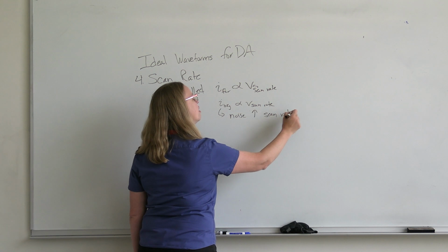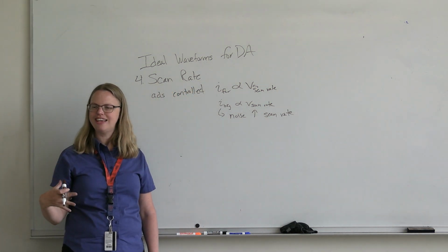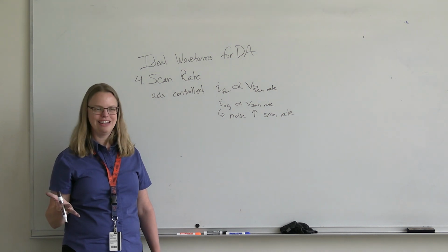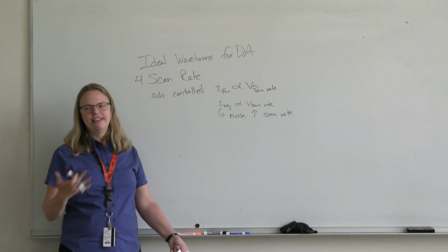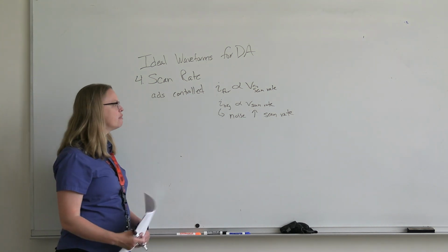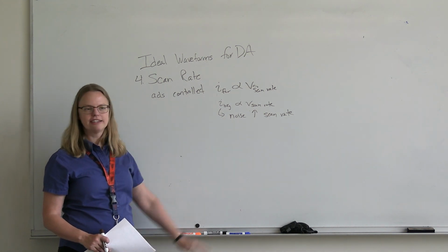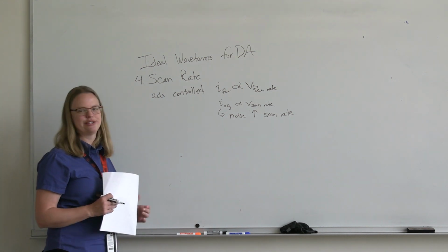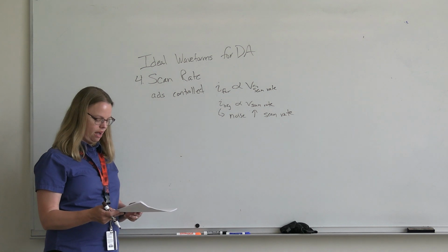So it's a little hard to just make the argument, go fast, go fast, go fast, because you'll get bigger currents. Yeah, you'll get bigger currents all around, which means you'll also get bigger noise. And what really matters in analytical chemistry is signal to noise. So you don't just win on signal, sadly. By the way, there's a 1980s Steve Weber paper that talks about this, and it's the only place I ever found where they actually do the theory on why the noise goes up with the background current going up too. I cite that paper a lot.